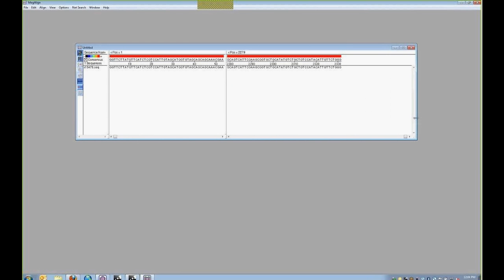Now the sequence that we just added to the program is the entire MIP-A gene for Aspergillus, complete with introns and 5' and 3' non-coding regions. However, if we just wanted to utilize the coding regions of a polypeptide associated with this particular gene, because we downloaded this sequence directly from NCBI, it includes with it all of the annotations and features that are associated with this sequence. So one of the features that MegAlign can do is utilize this information to present only the MIP-A polypeptide.